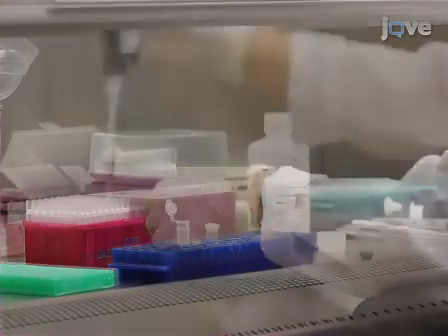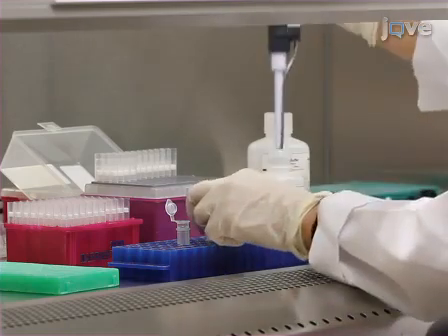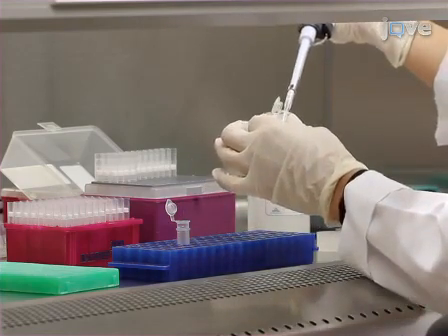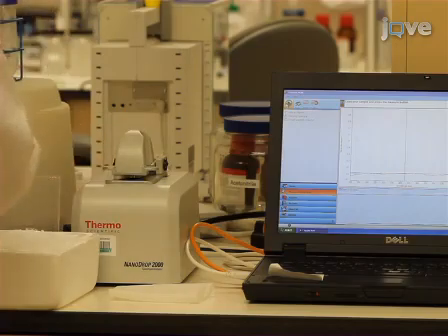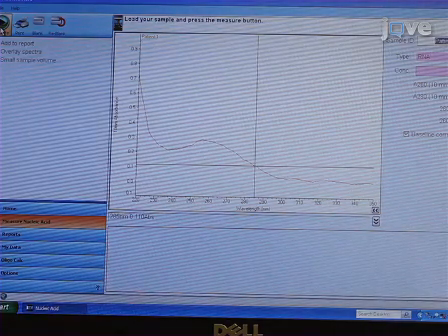Follow this with RNA extraction, using the Zymo ZR Viral RNA Extraction Kit or QIAGEN UltraSense Virus Kit per the manufacturer's instructions. Measure the concentration of the extracted RNA using a NanoDrop nucleic acid spectrophotometer. RNA concentration is preferably at least 10 nanograms per microliter, but will vary from sample to sample.